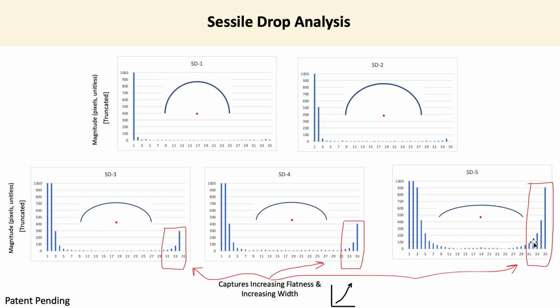For example, you could sum all these bars, or you could fit an exponential curve to, say, the last 5 bins, and compare the coefficient of the exponent as an index, comparing these 3 shapes. That is if you wanted to derive a scalar value. That's another way of doing it, fitting an exponential curve. And so this again goes to show the depth of information that the LCPC transform extracts from seemingly basic shapes.